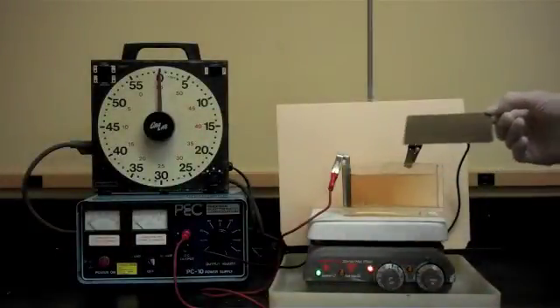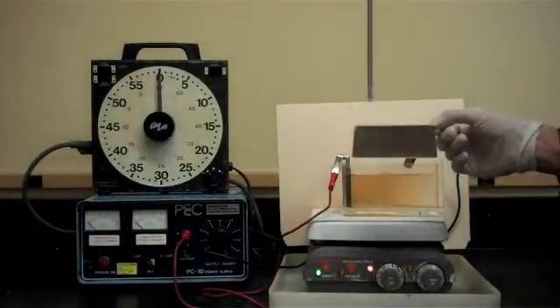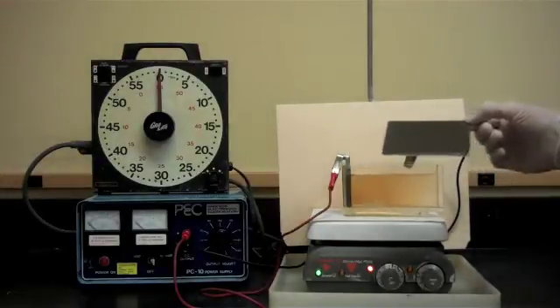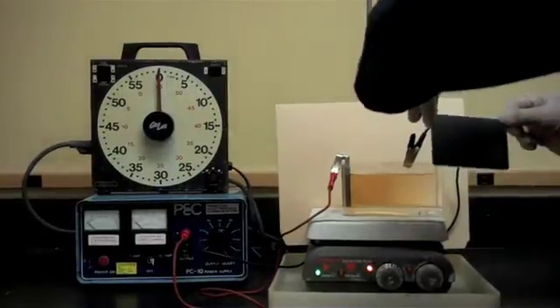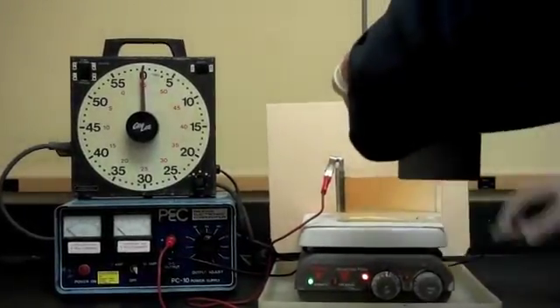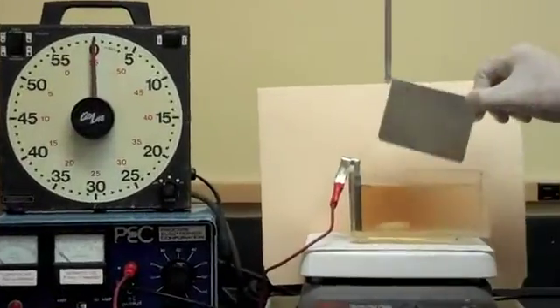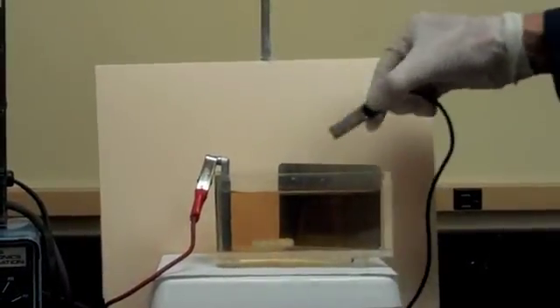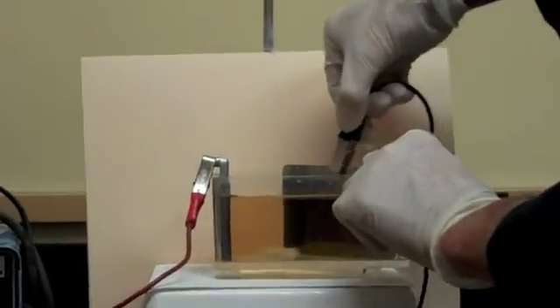Okay, here is our Hull Cell test panel which has been stripped of the zinc coating, and we are now ready to start this test. So we will take the panel and put it into the angled portion of the Hull Cell, and we are going to connect the negative lead to the test panel.